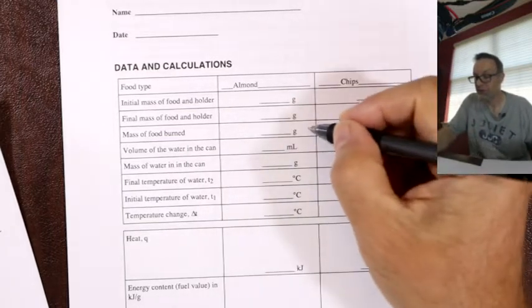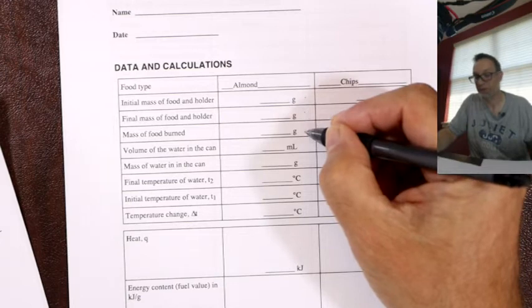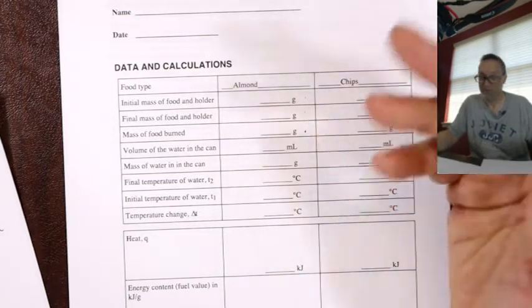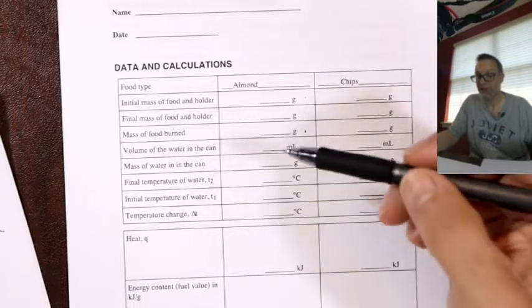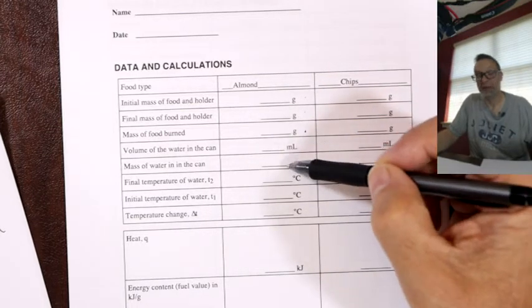So that's going to be a small number. So you subtract these to get the mass of the food burnt, right? Now, because water has a known density, you can turn the volume of the water in the can into the mass of water in the can.